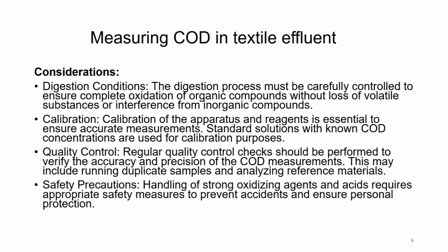Consideration. Digestion conditions. The digestion process must be carefully controlled to ensure complete oxidation of organic compounds without loss of volatile substances or interference from inorganic compounds. So, this has to be done very carefully. Calibration.